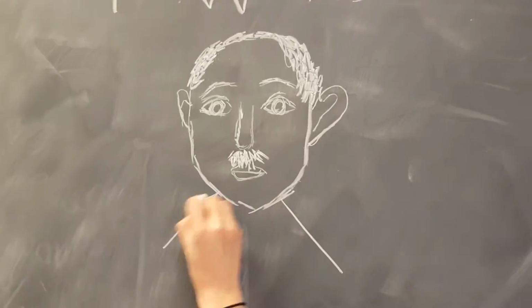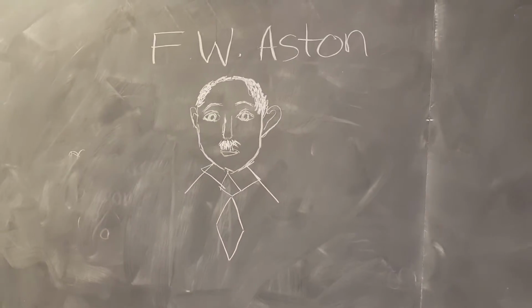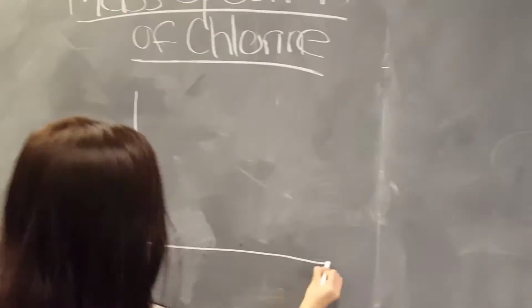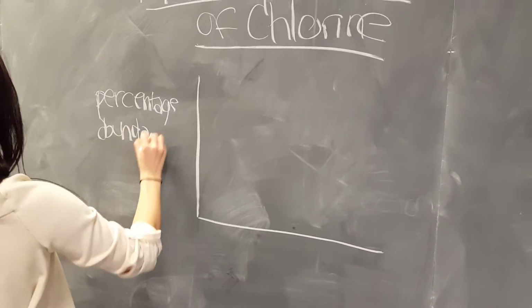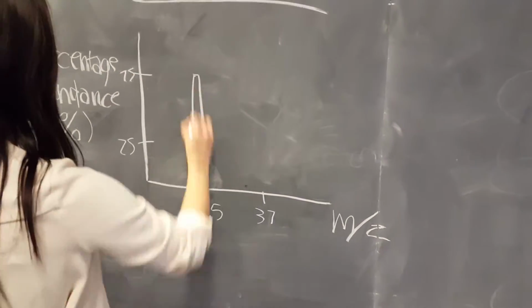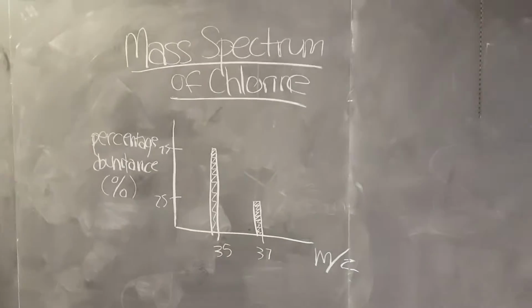of neon isotopes by J.J. Thomson. Mass spectrometry became the method of choice for measuring the mass of an atom or molecule. It creates a mass spectrum, which visualizes the relative abundance of particle mass in a substance.